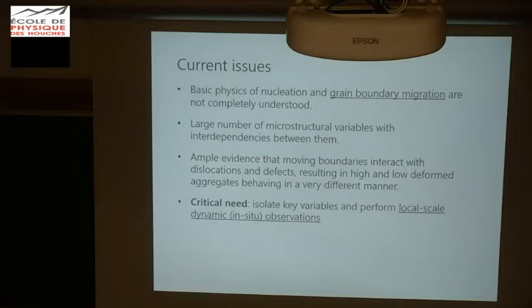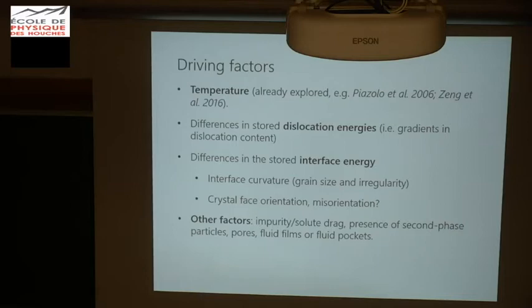So we think that the critical need to go further in this topic is to design experiments that isolate key variables and perform local scale dynamic in situ observations. The driving factors of recrystallization, the most obvious one is of course temperature, and it is the most studied one too, because this driving factor was already explored in previous studies using the same approach used here. This is quasi-in-situ EBSD. The next driving factors that come to mind are differences in stored dislocation energies and differences in stored interface energies, and both driving factors compete against each other.